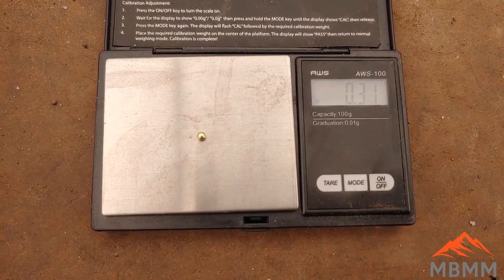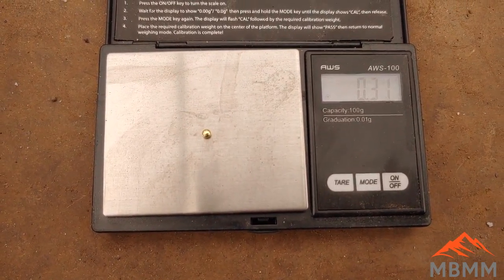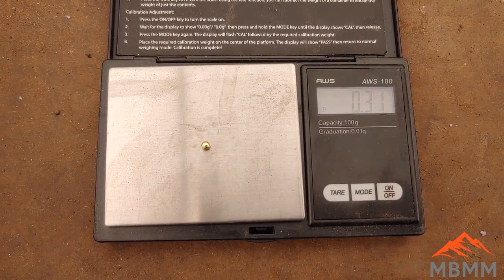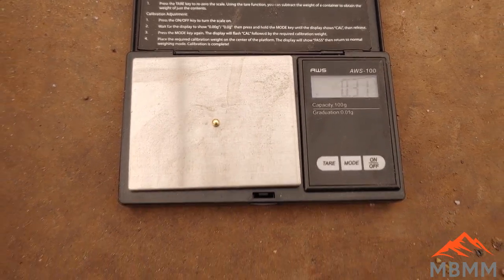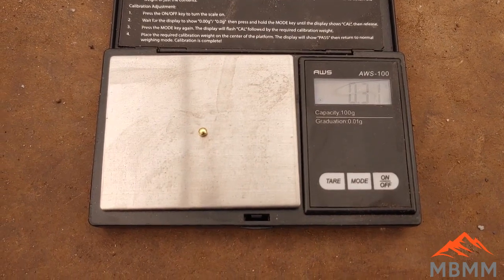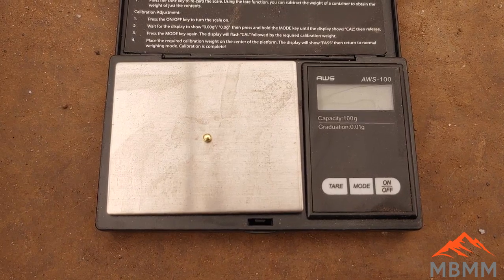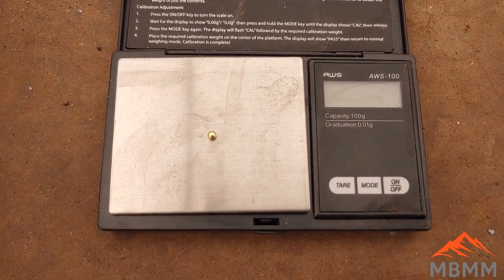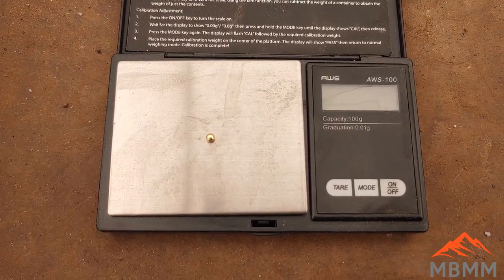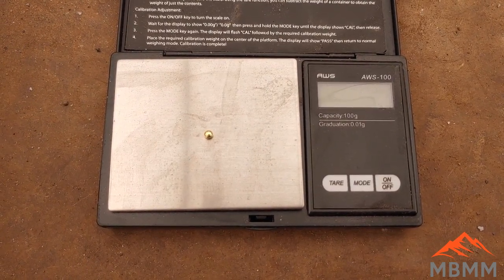When you do the math: we ran two kilograms of material and ended up with 0.31 grams. Multiply 0.31 by 500 and you end up with a little over 150 grams per ton. That stuff has definitely got some gold in it. I handpicked some material that looked good, so I'll need to go back and get a bulk sample from the dump pile and run that to see the true gold content.